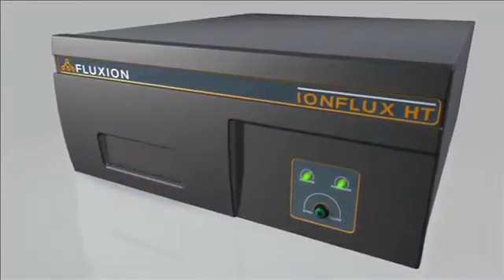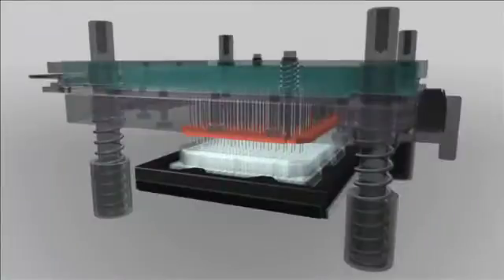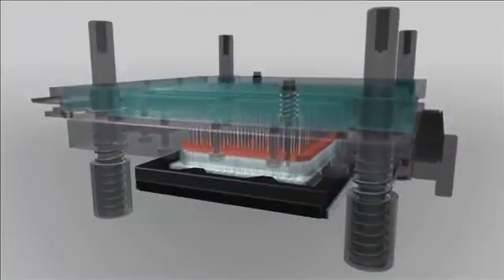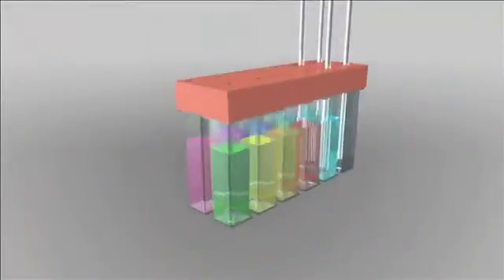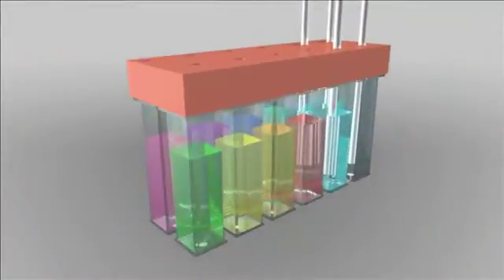Once inside the instrument, a pneumatic interface seals against the top of the plate which provides regulated air pressure and vacuum into the wells. The interface also contains an array of electrodes which dip into specific wells on the plate involved with the recording.